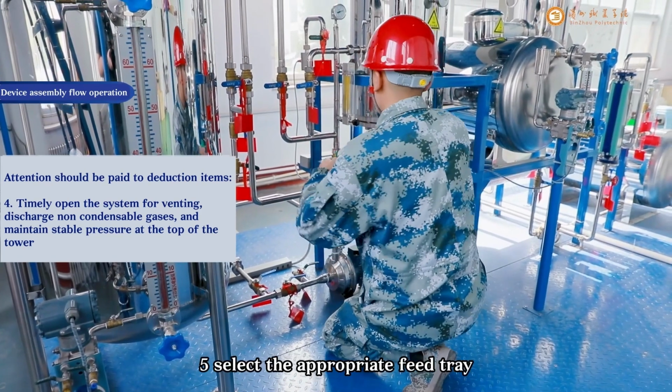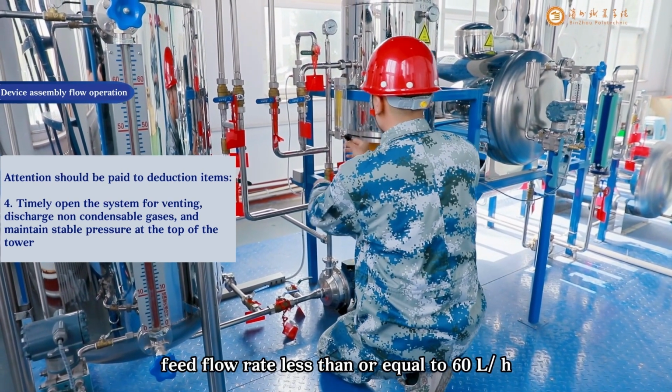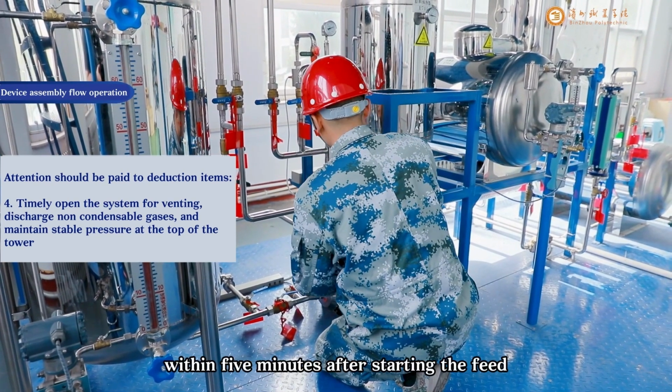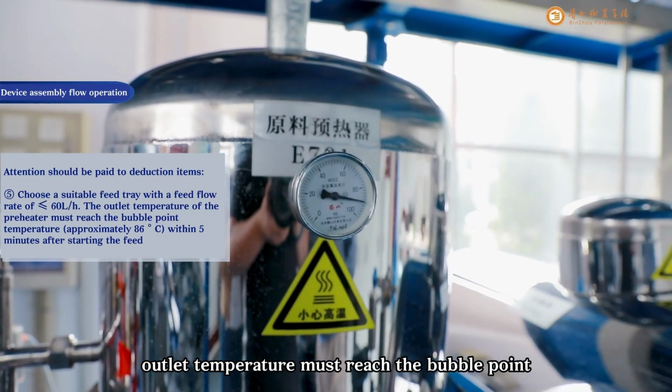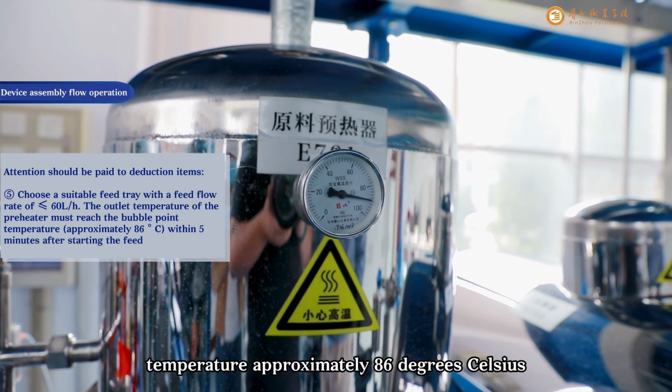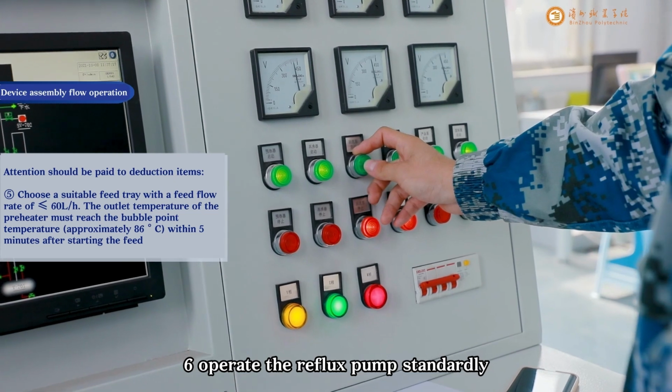5. Select the appropriate feed tray. Feed flow rate less than or equal to 60 liters per hour. Within 5 minutes after starting the feed, the preheater outlet temperature must reach the bubble point temperature, approximately 86 degrees Celsius. 6. Operate the reflux pump standardly.